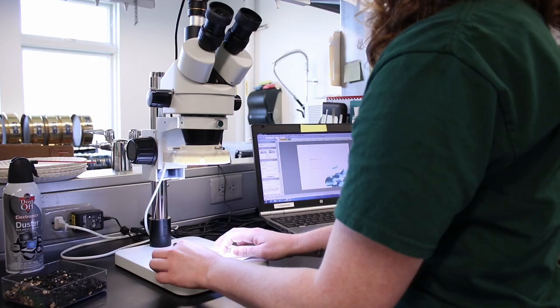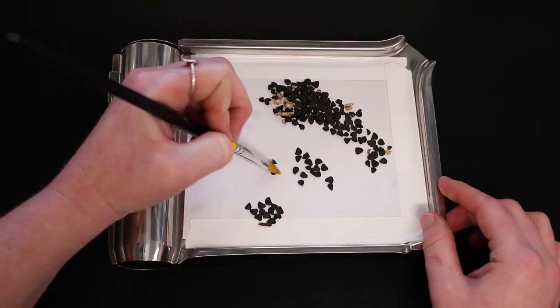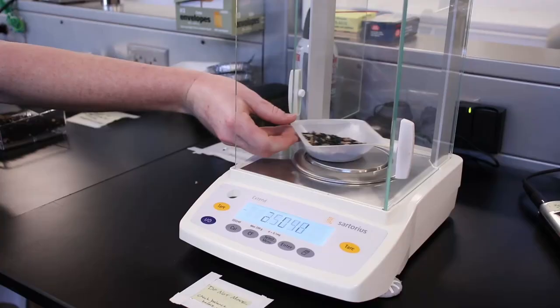After we clean the seeds, we bring them over to be photographed. We count the seeds either by hand or weighing samples.